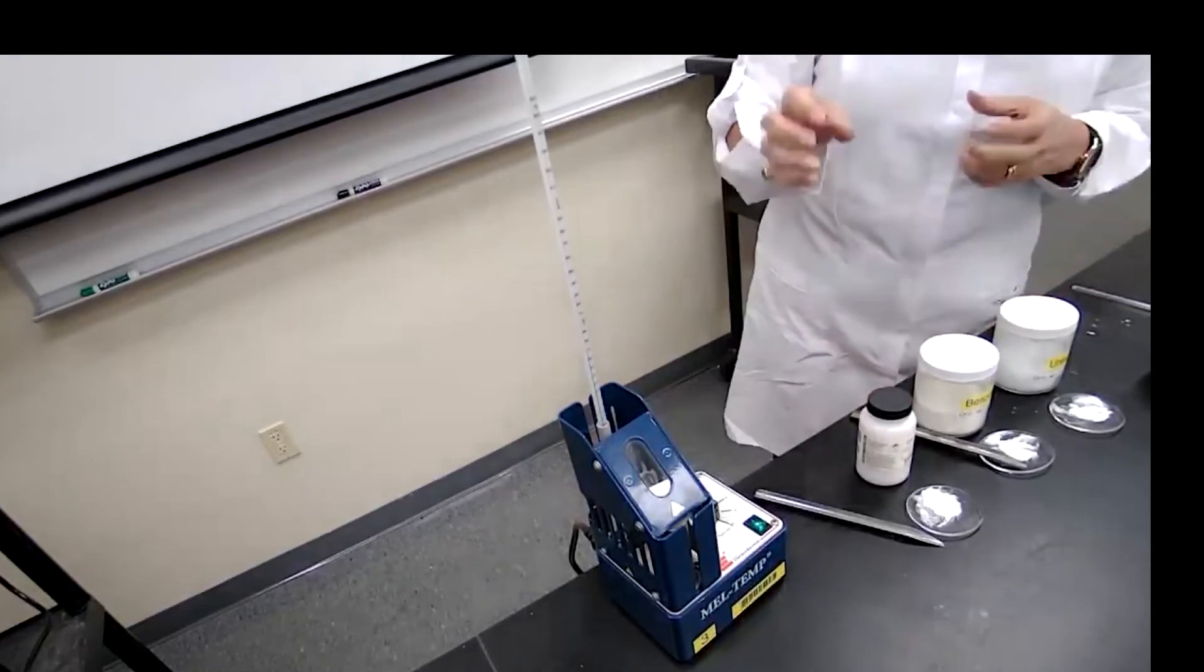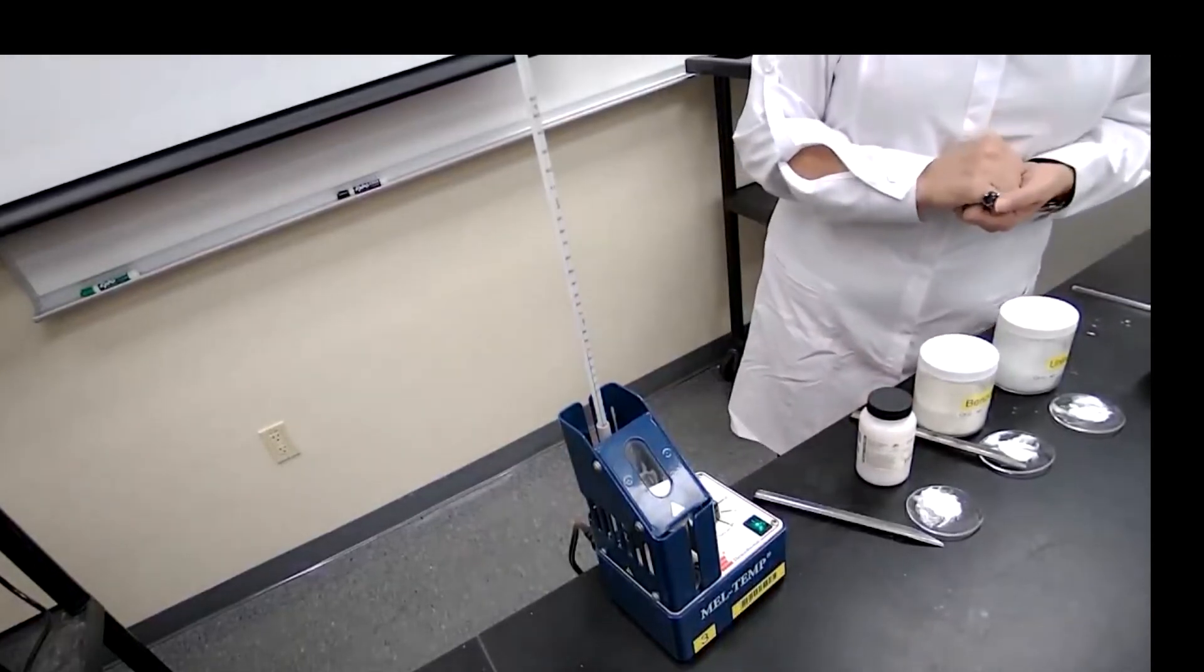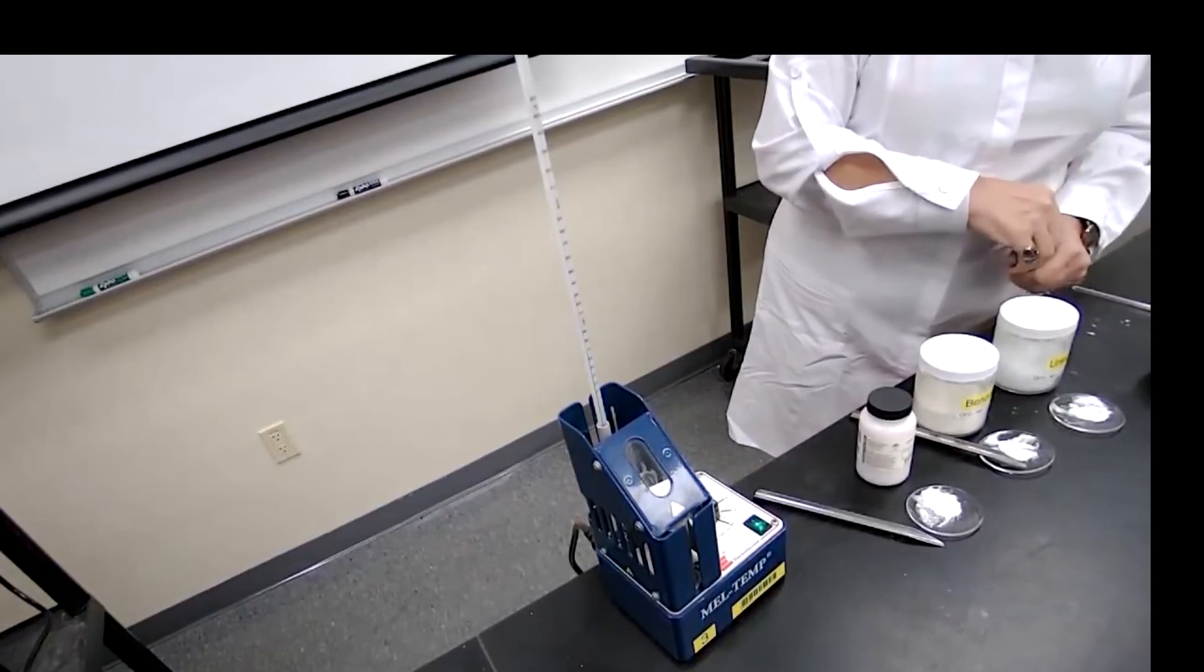I will give you an image for you to read the number for the melting point.